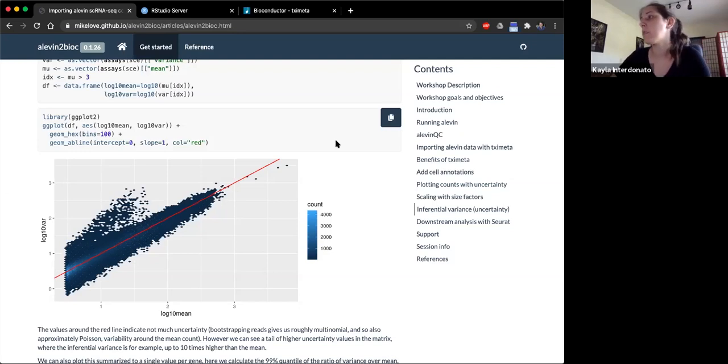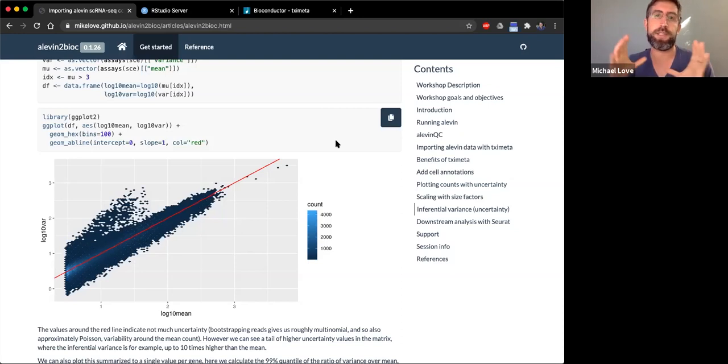How do you handle multiple samples? Does each need to be read in separately with tximeta and then somehow combined? Yeah. Right now, this is just giving you one single cell experiment, which is one sample. Avi, do you have thoughts on processing of multiple samples?